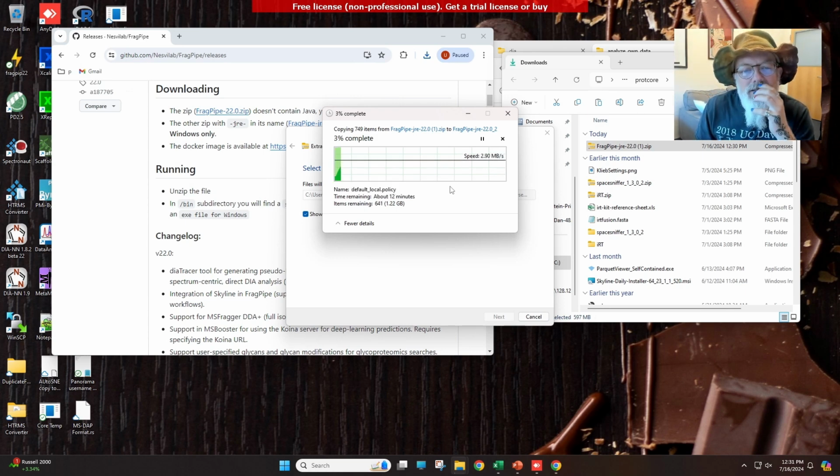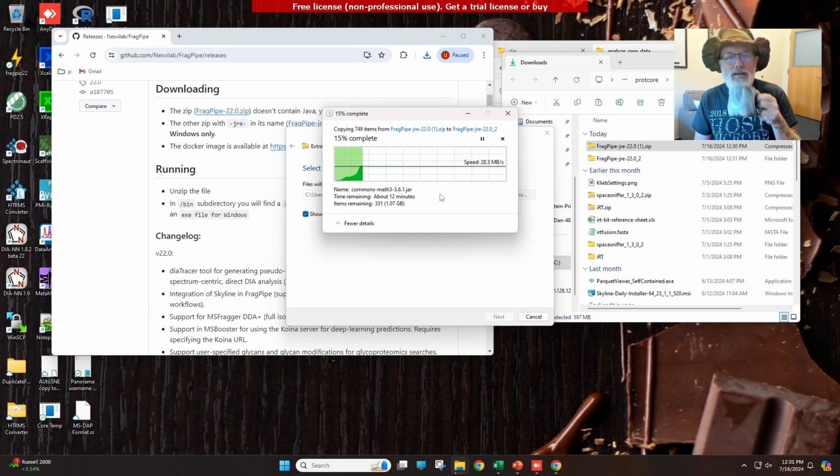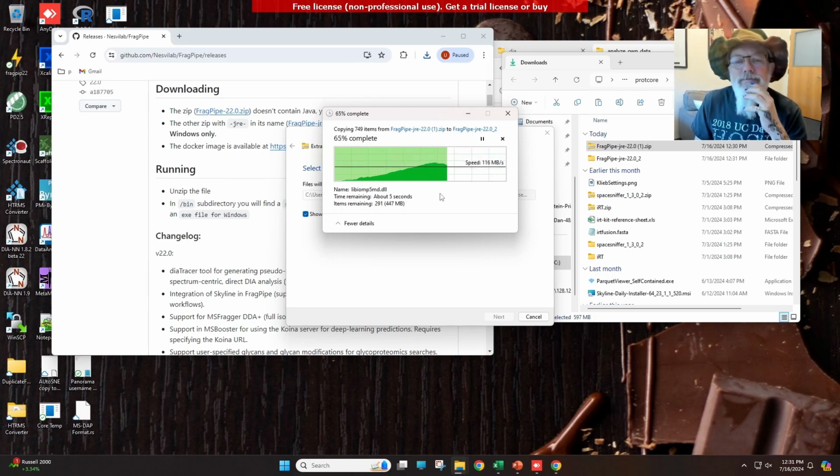Okay, all right, so this should only take a minute. Hopefully it'll speed up. It helps if you have an SSD drive to do all of this data analysis, so I'd recommend getting one because it speeds up pretty much everything a lot.